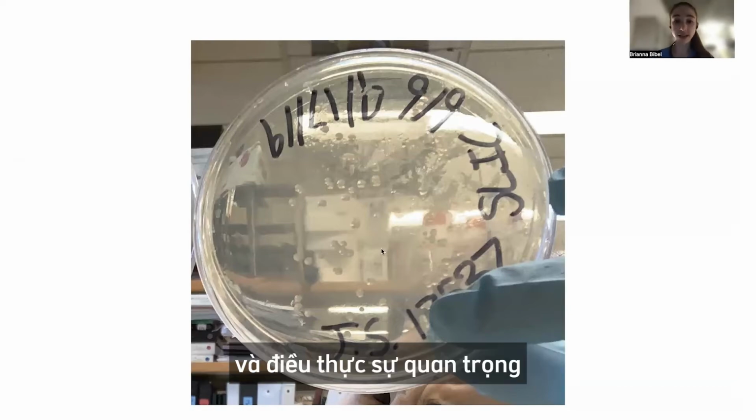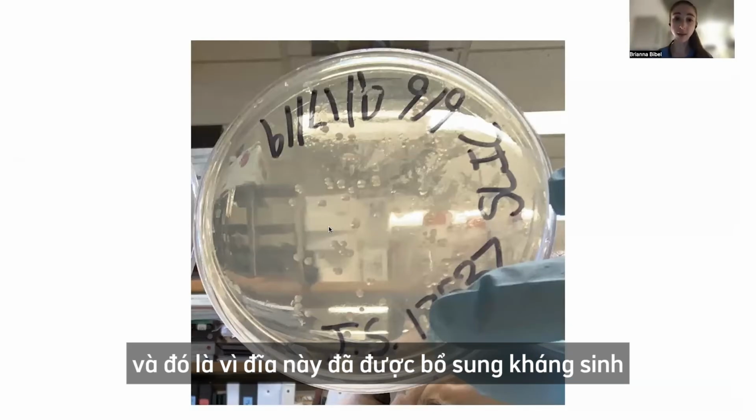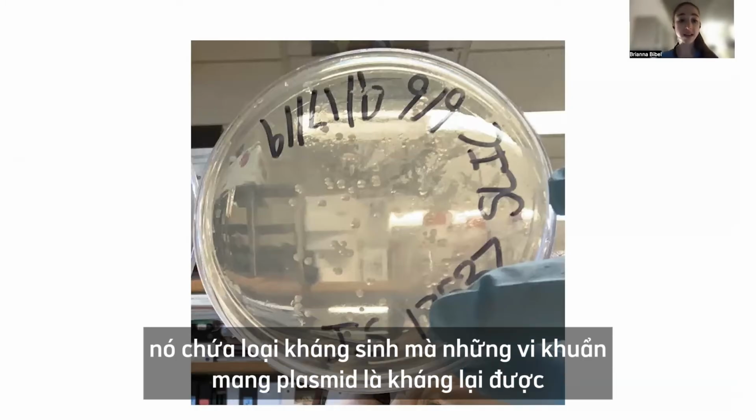What's really important is that you have these distinct colonies, and you can see that there's nothing else growing around them. That's because this plate is spiked with the antibiotic that the bacteria that have the plasmid are resistant to.